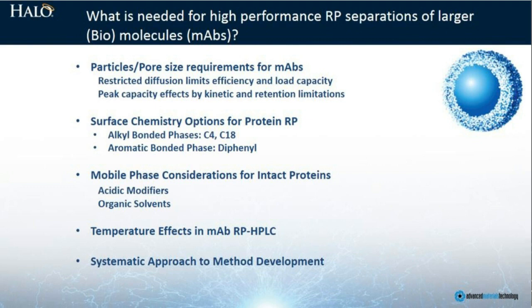So peak capacity, which is a convenient chromatographic measurement of global separation capability, has limitations caused by both kinetic and retention properties. And these are addressed by using sufficiently large pore sizes.